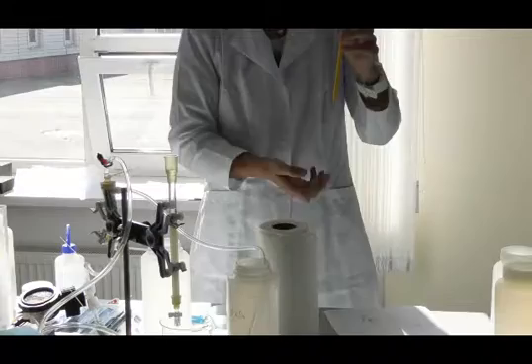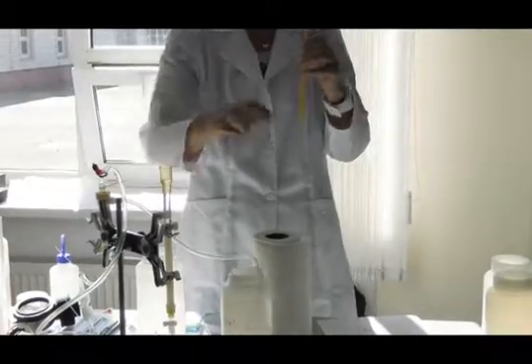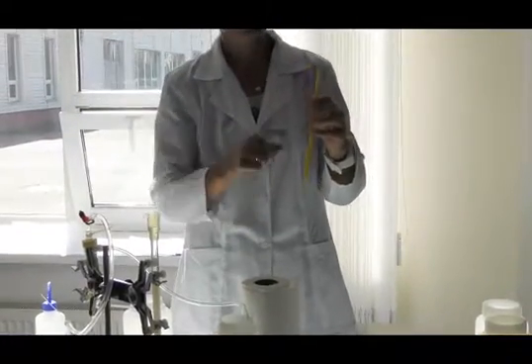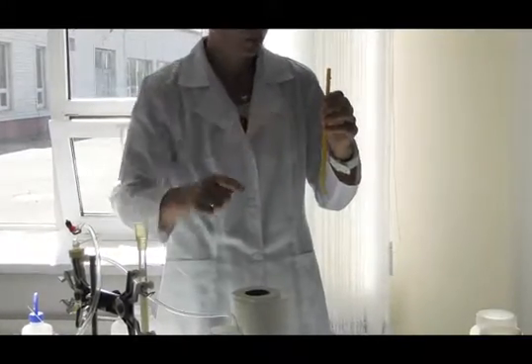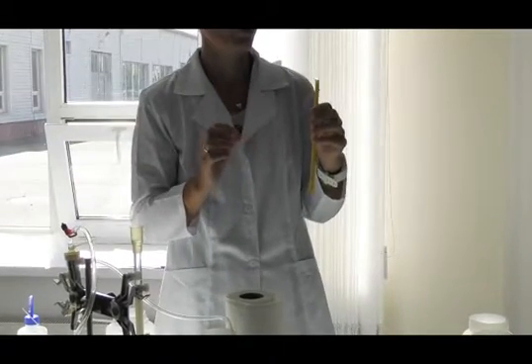So all the time you have the sample just going through. The whole sample is not pressed through the filter. And then you avoid clogging, and that the pores will be closed. So you're actually washing the filter all the time as you are sampling, and you avoid getting the wrong size of the fractionated water coming through.